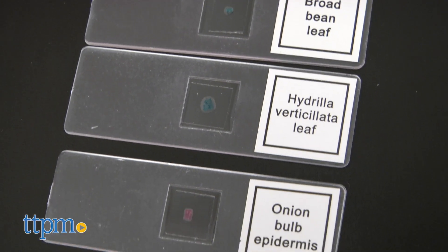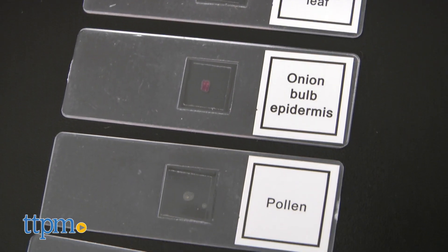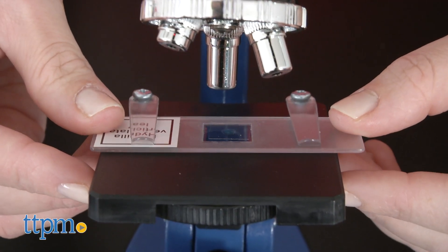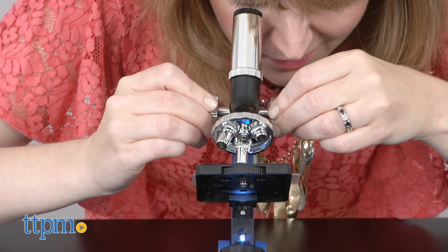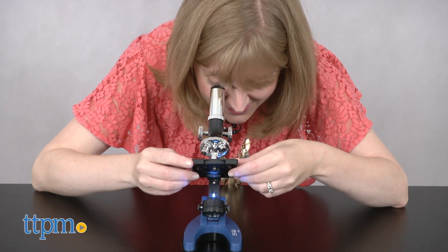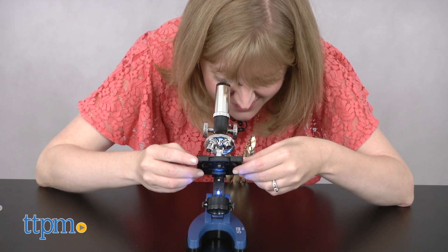This kit is a nice way to help kids become familiar with using microscopes, and because it's battery operated it's easy for kids to take it with them for exploration on the go. It comes with tools and suggested experiments to get kids started, but hopefully curious kids will want to get more hands-on, close-up looks at everyday objects on their own.